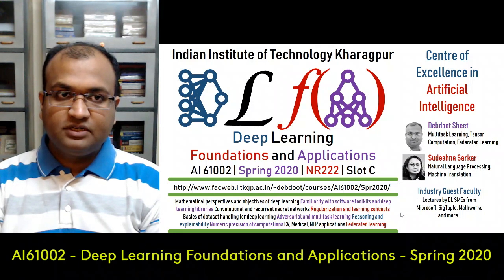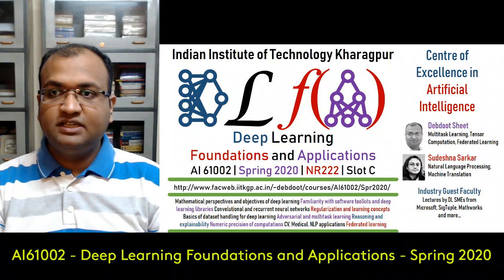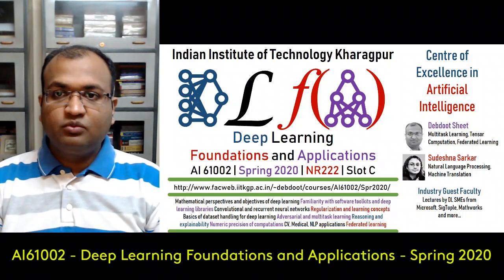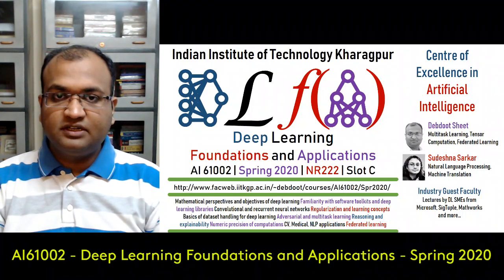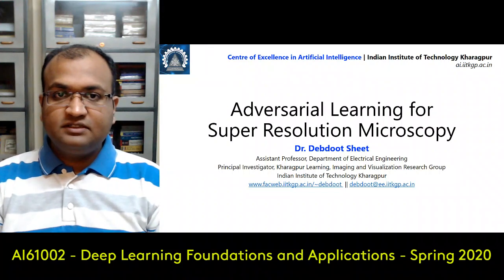So today we are going to start with a very important and interesting application area, and this happens to be from one of the recent product translations which we have done across, and that's available now. The area essentially is what is called super resolution microscopy.